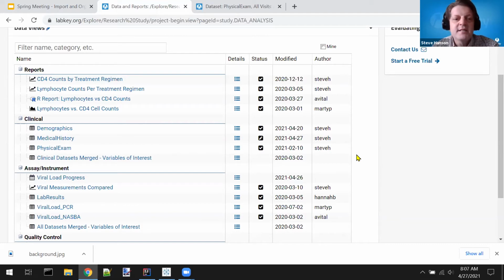If we use an assay design, LabKey really respects and knows that you're working with experimental data, and it'll give you lots of features around that, like the ability to tie it to the original file, or divide and group your assays by runs of the instrument, things like that. If you import it directly as a data set, it's a little bit quicker, a little bit cleaner.